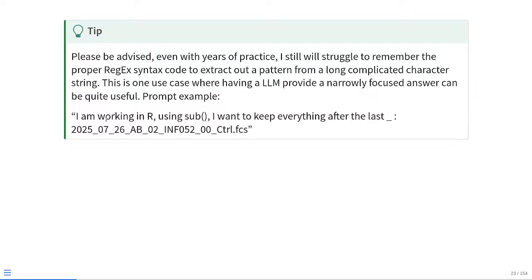One thing to note is that even with years of practice on my end, I still often struggle to remember what the proper regular expression syntax code is to match an exact pattern. This is because it can get complicated when you're trying to target a specific location, like what's the difference between the second and the third underscore, or the first and the second hyphen. This can be a little dogmatic when it comes to actually building out a regular expression.